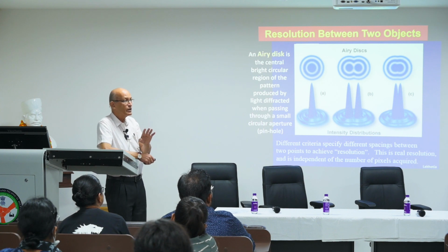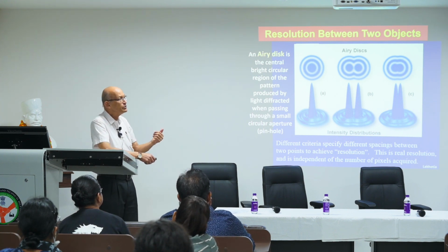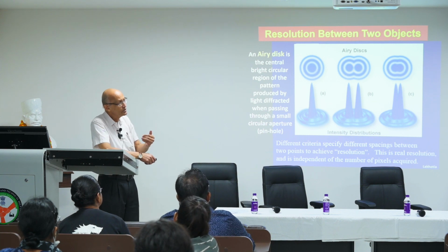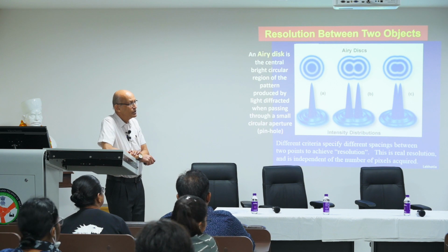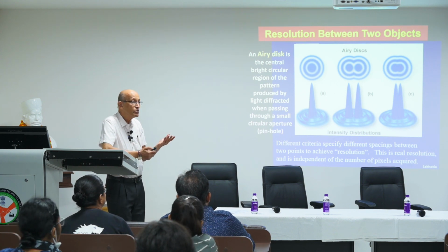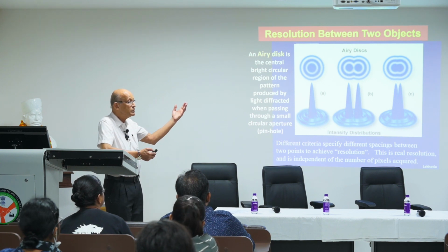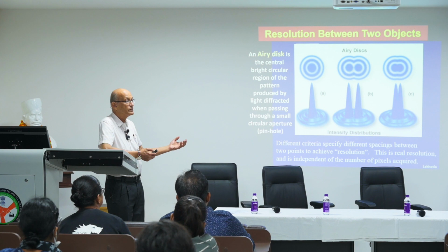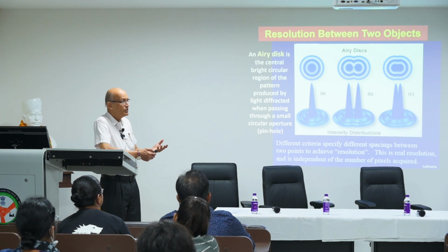And this software provides that option for how much pinhole you want. You can choose 1 Airy unit, 1.5 Airy units, and accordingly it will adjust the opening of the pinhole. If we decrease the pinhole to less than 1 Airy unit, you are not gaining anything, you are only losing information, with no resolution change. Your image will become less bright because you are giving less light, and that's not good.